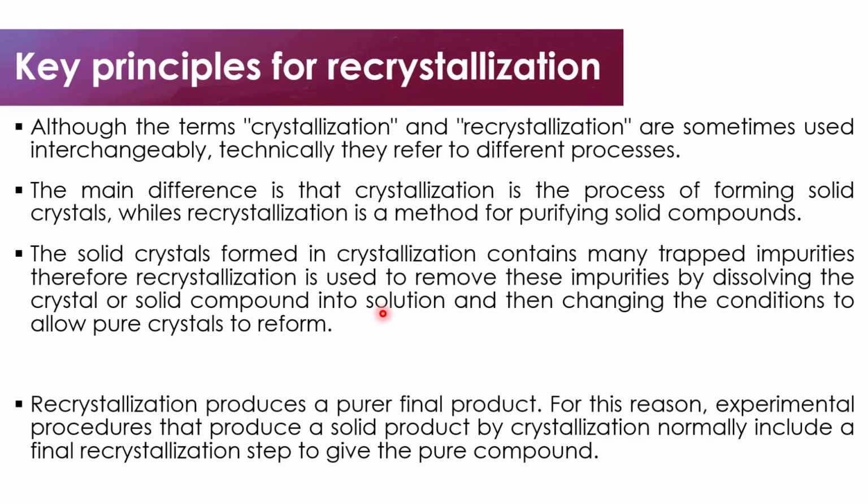Therefore, recrystallization is used to remove these impurities by dissolving the crystals or solid compounds into solution and then changing the conditions to allow pure crystals to reform. Recrystallization produces a purer final product. For this reason, experimental procedures that produce a solid product by crystallization normally include a final recrystallization step to give the pure compound.